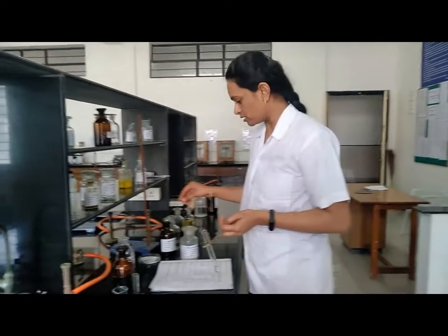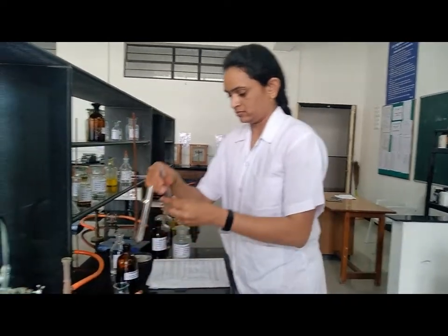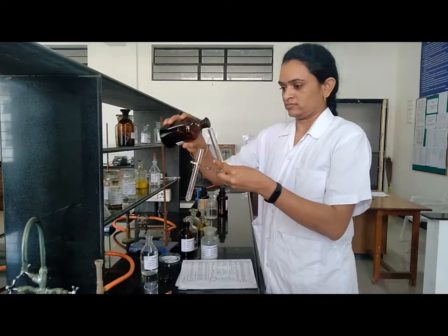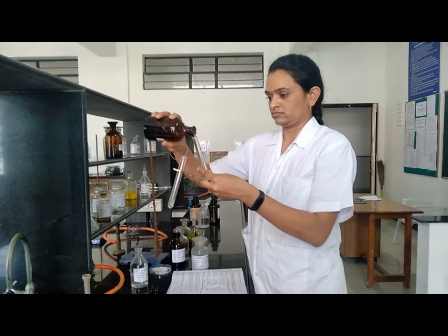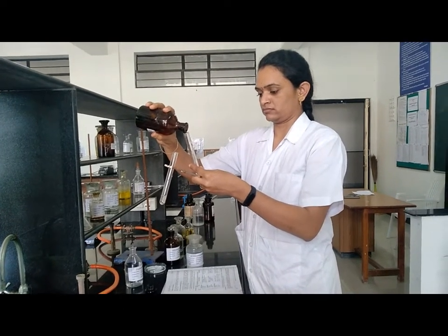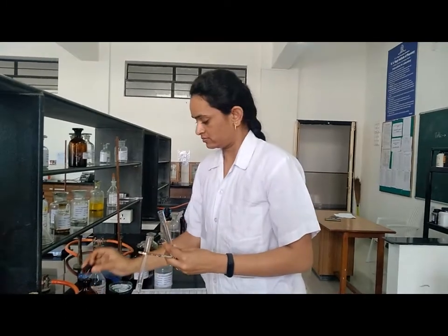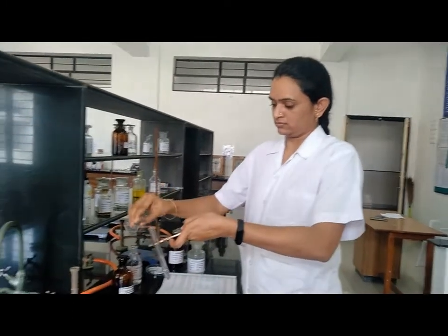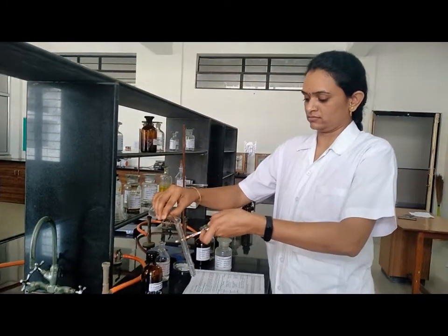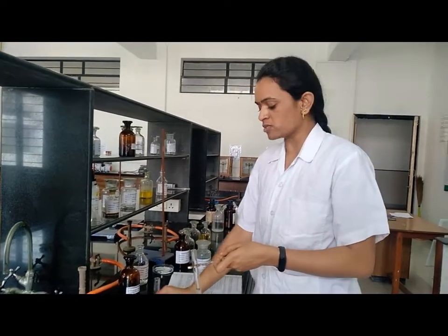We have to add 3 ml of alcohol, and 3 ml of sulfuric acid.